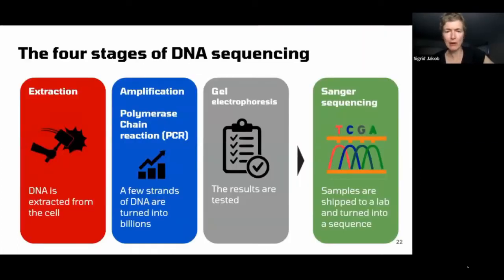But let's talk about DIY sequencing then, because I think a lot of people want to dip a toe into that water. Just very briefly, an overview of the different stages of the process. We're going to go through them in a little bit more detail later.